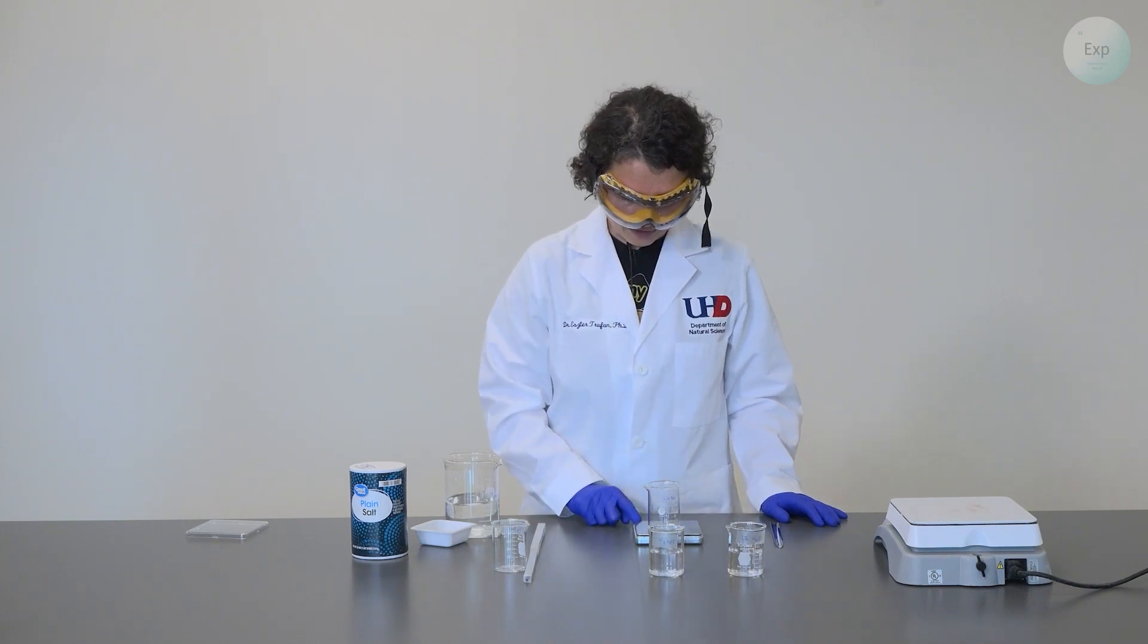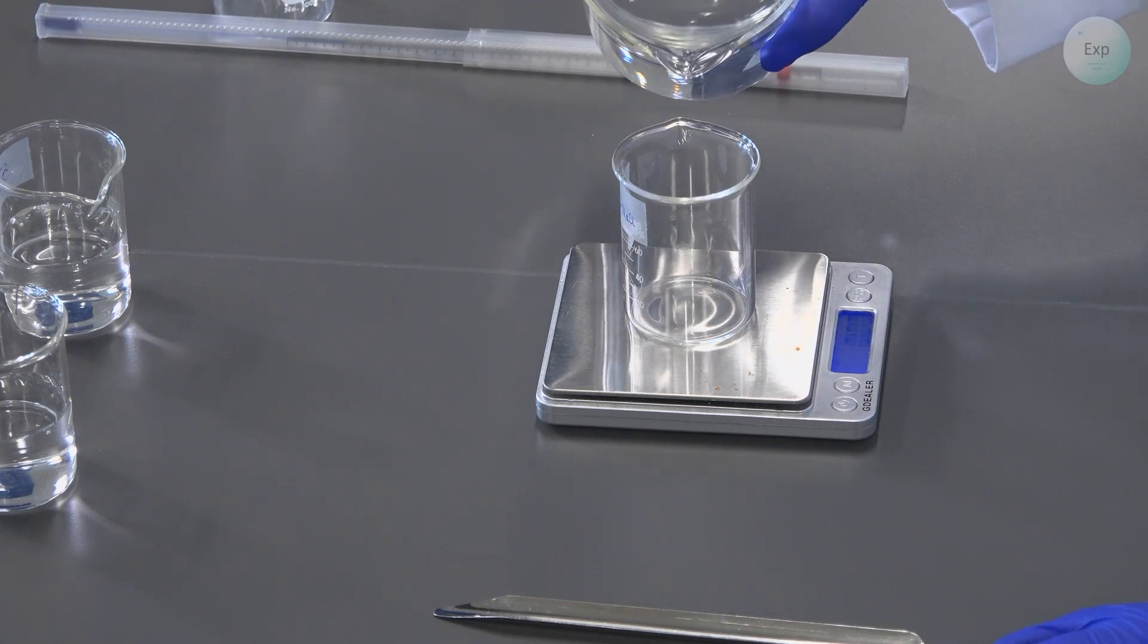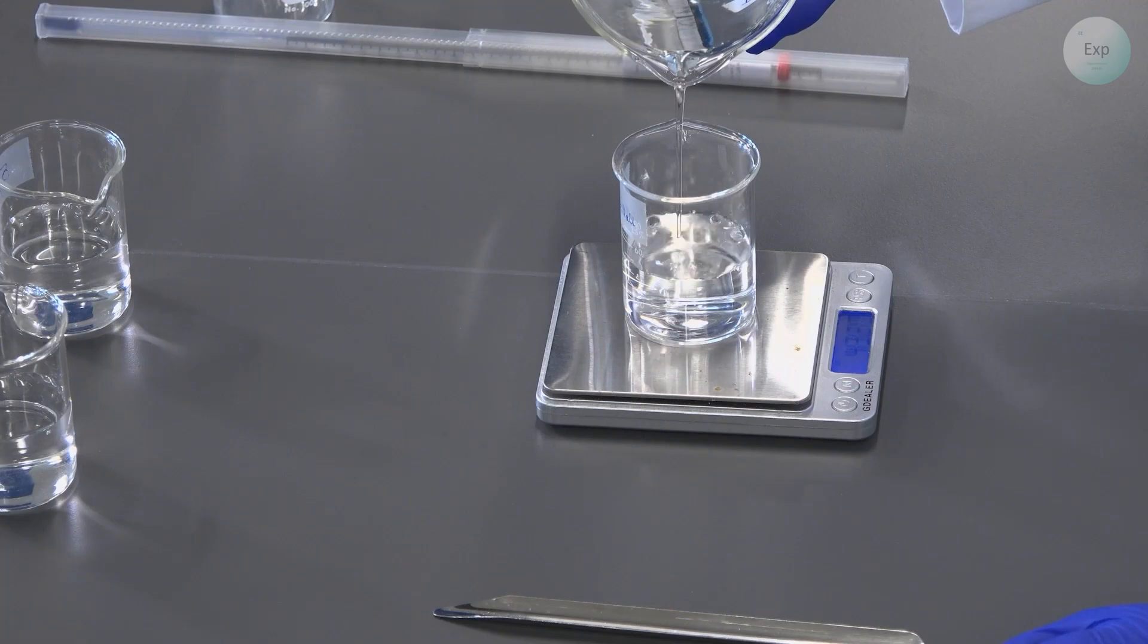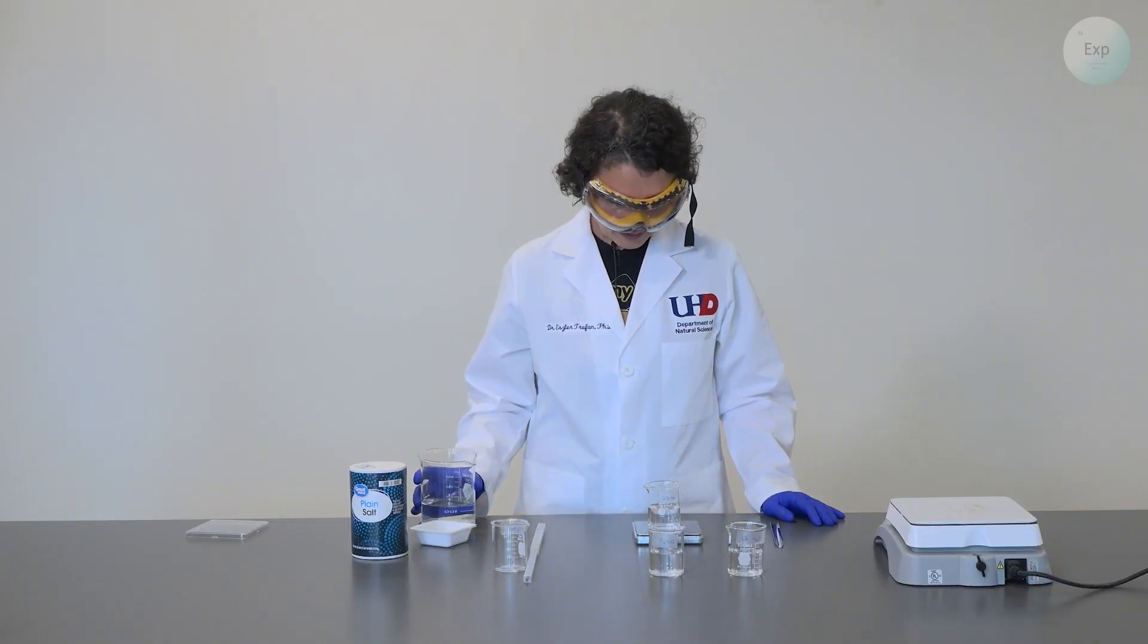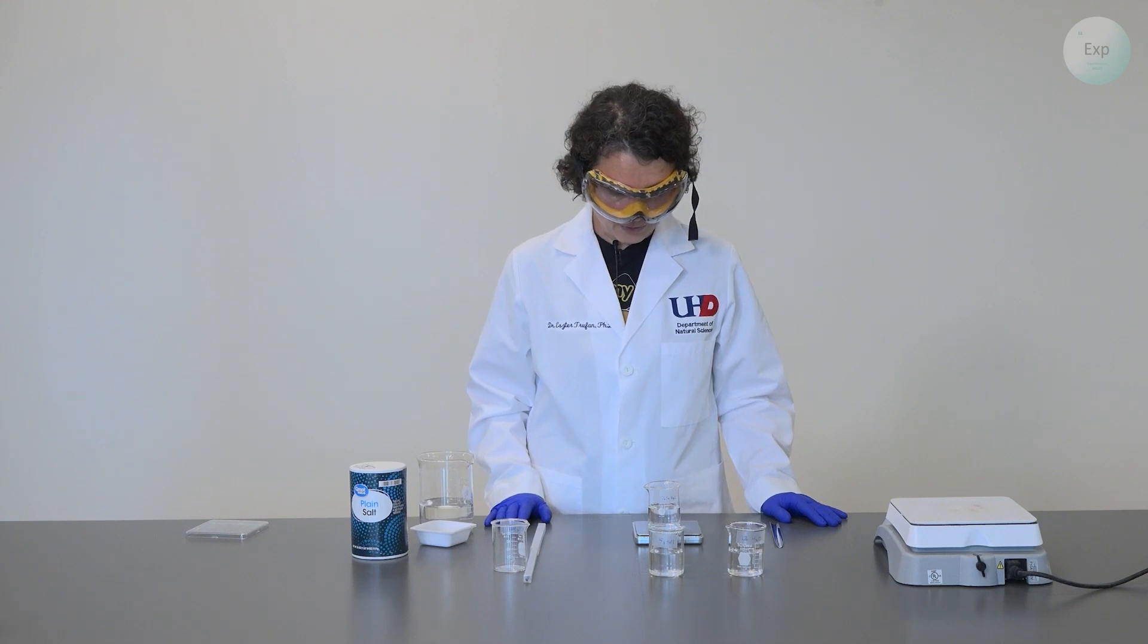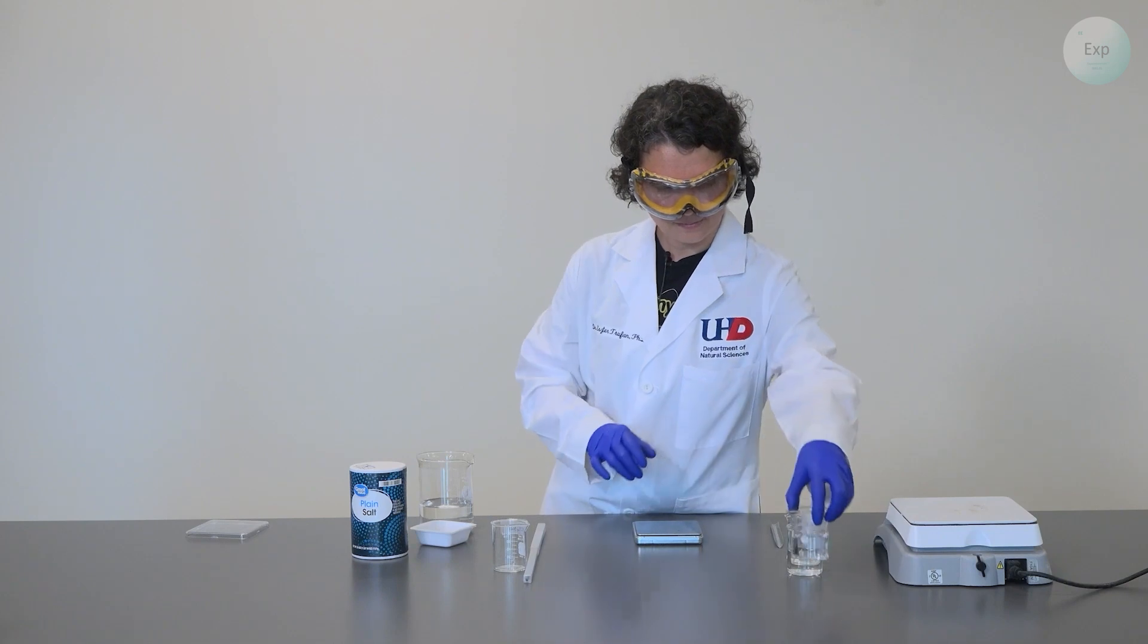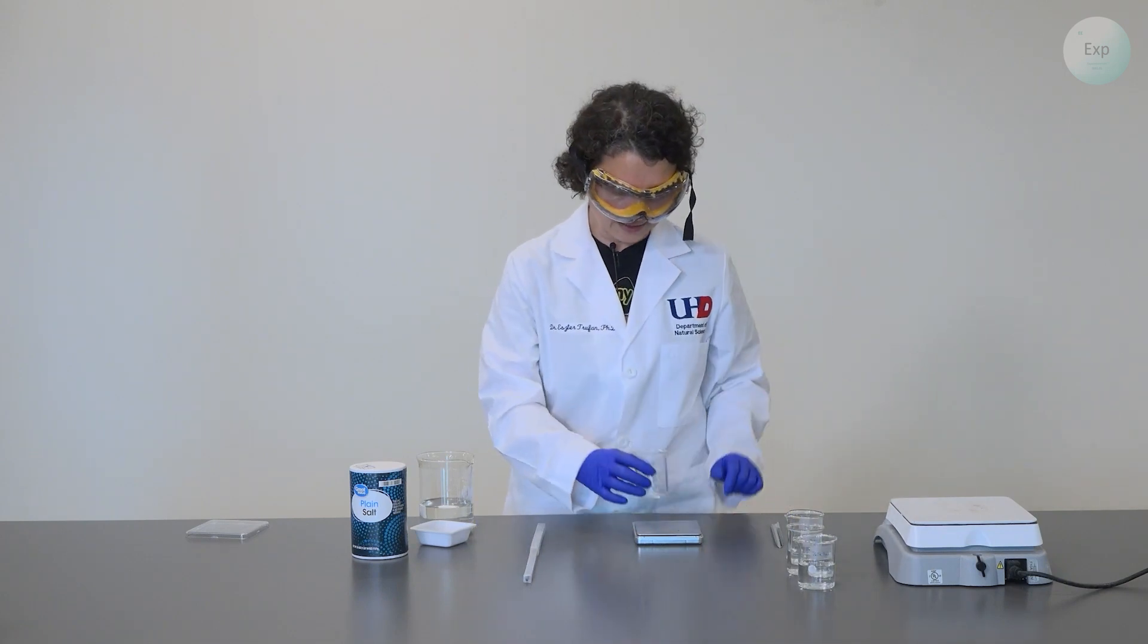Next, I will place my third beaker on the scale, tare it, and add 50 grams of water to it. I am very close at 49.89 grams. This one will have 7.5 grams of sodium chloride added to it later.